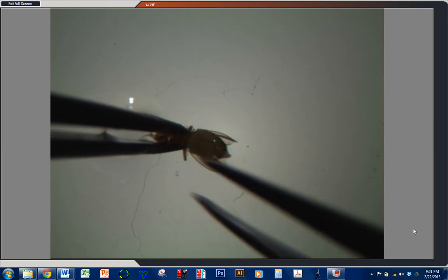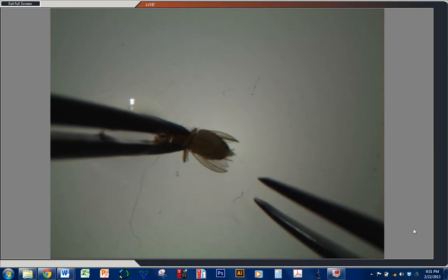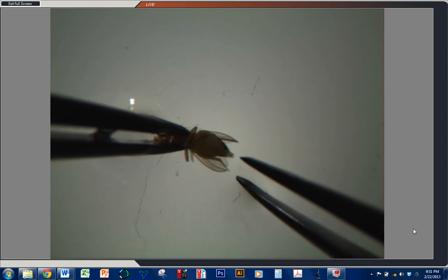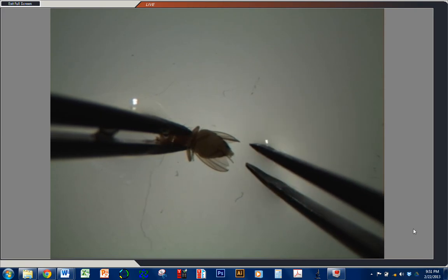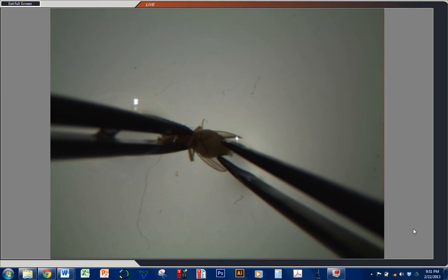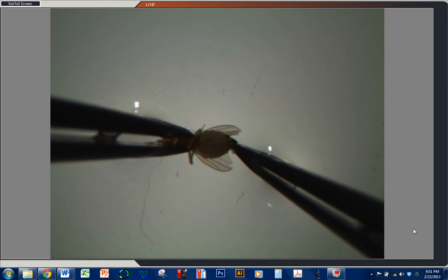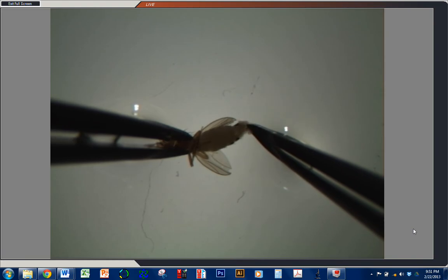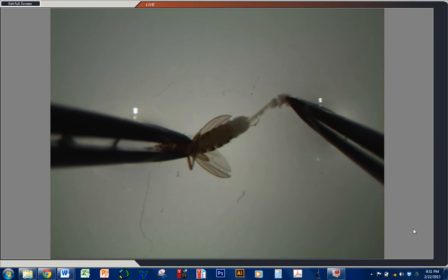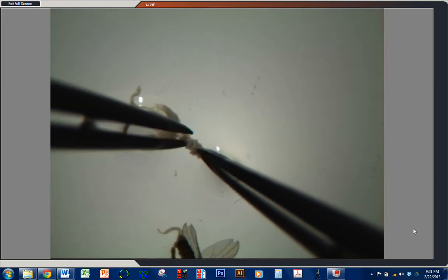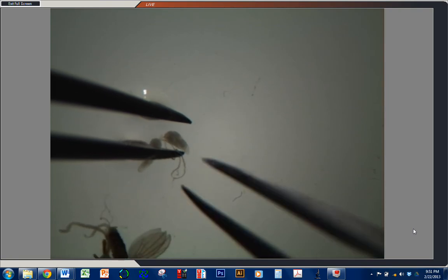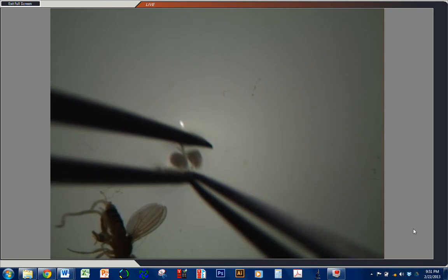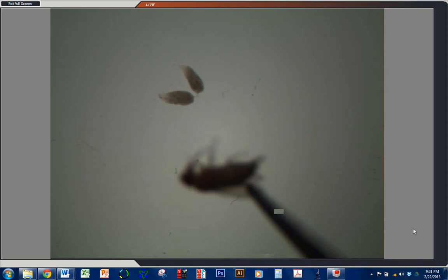And so you'll see I've got two tweezers in my non-dominant hand. I'm a righty, so in my left hand I'm holding the thorax with the less sharp pair of tweezers. And then in my right hand I've got my sharper tweezers. And I'm going to grab the last segment of the abdomen and just pull. Now we're fortunate here that the ovaries have come out right away. That's not always the case, so I'm going to grab another fly.